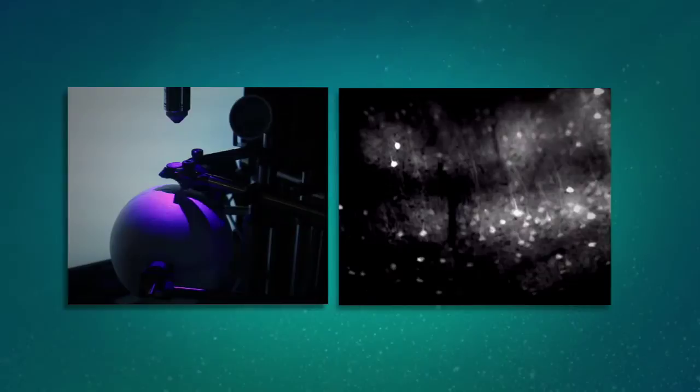So these experiments gave us a green light to go beyond anatomical imaging towards functional imaging through the prism, where we could image all six layers simultaneously.